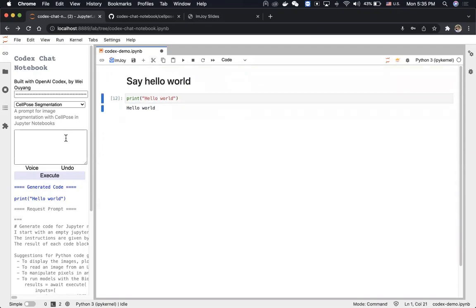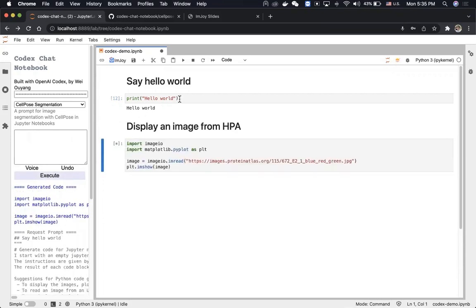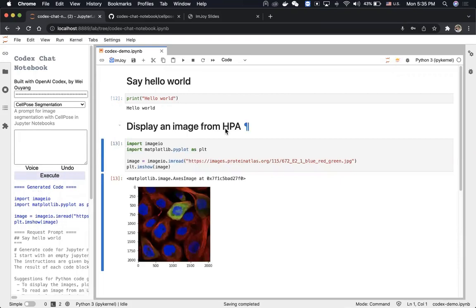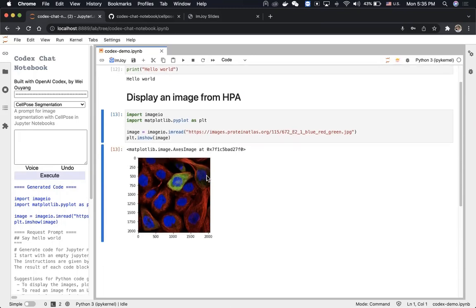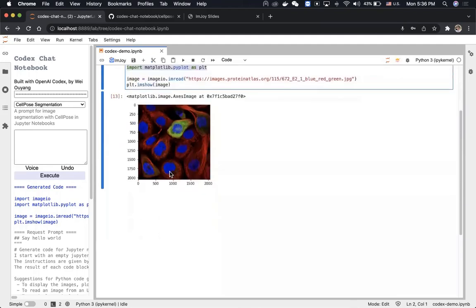Now we can try to display an image. I'll say 'display an image from HPA' — HPA is the Human Protein Atlas. Because in the prompt we already told it how to get an example image from the Human Protein Atlas, it also displays the image with matplotlib, including importing the library, reading the image, and displaying it.